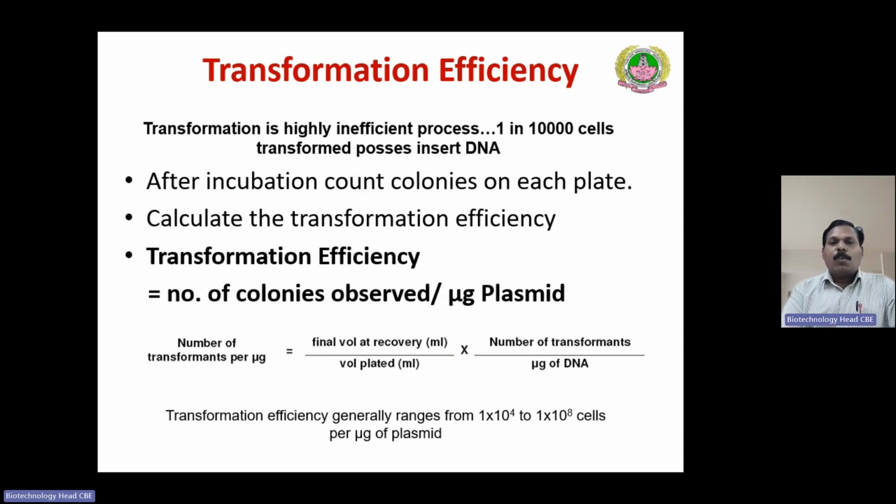Okay, once we are good at transformation, we can also work out how efficiently our transformation process was carried out.